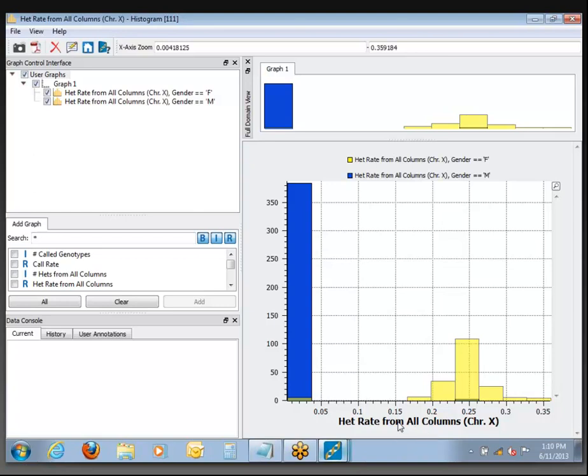It's all laid out on the next page, exactly how you would sort and filter and figure out which ones have the bad gender labels. You can either manually turn off those rows in your spreadsheet if you don't want to use them going forward, or edit the spreadsheet and change them to the correct values — although quite often it means that you can't trust the phenotypes for those samples at all.